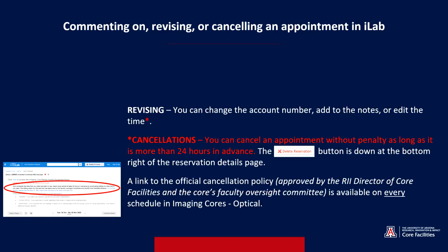Just remember that there is a cancellation policy, and you should make any changes to your appointment at least 24 hours in advance. Less than that, and you could end up paying for things. So, for example, deciding at the last minute that you're not going to come in, you'll be paying for the number of hours that you reserve. More than 24 hours in advance, just click Delete Reservation and you're good. There is the full policy. We're going to provide a link down below, but also it's on every schedule in iLab. There's a link to it.